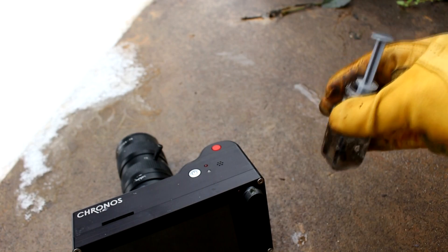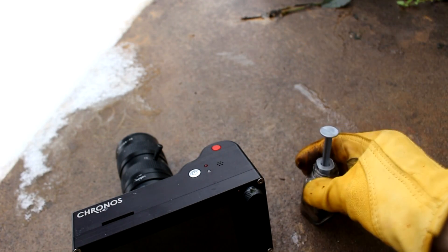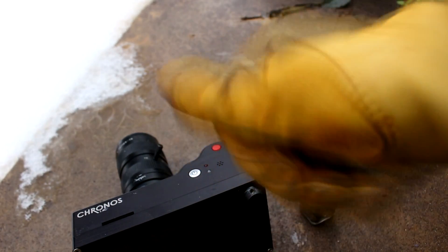So I'm going to leave you guys with some high speed shots of me dropping the rest of the cesium into some water. And until next time, I'll see you then.